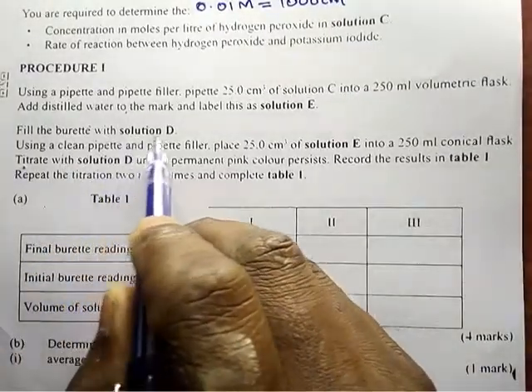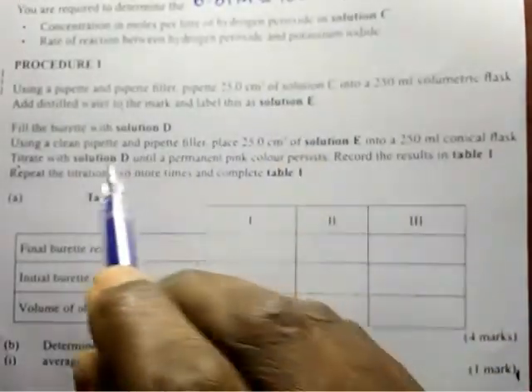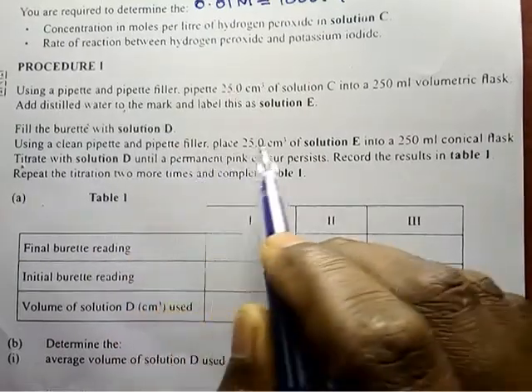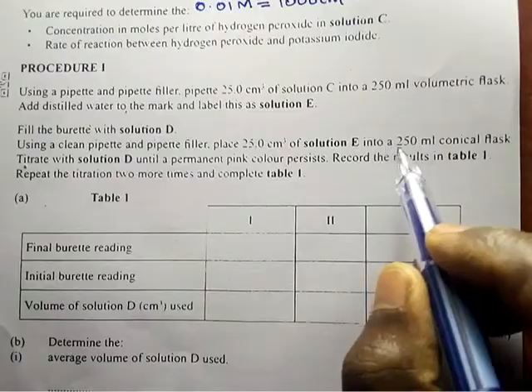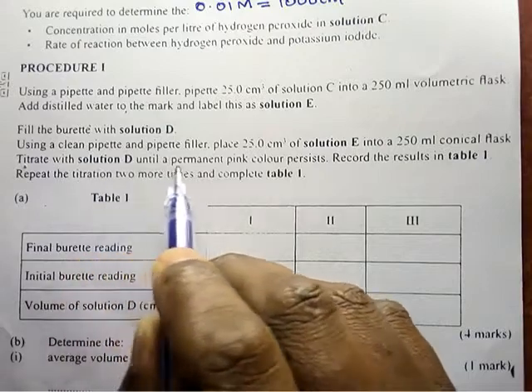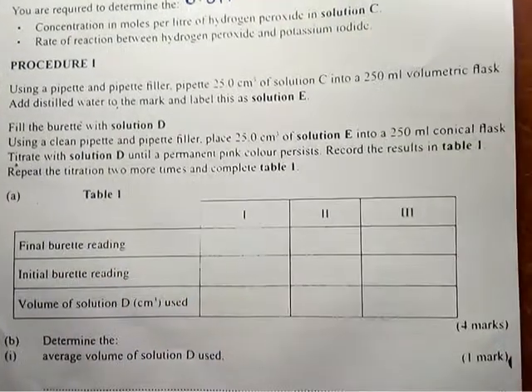Fill the burette with solution D. Remember, solution D is potassium permanganate. Using a clean pipette filler, place 25 of solution E into a 250 ml conical flask. Titrate with solution D until a permanent pink color persists, and then fill the table.